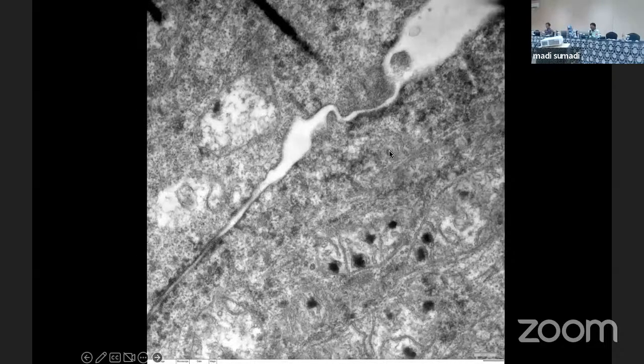And in the cells, you see one endothelial cell connecting to the other endothelial cells. Exactly, you see the connections, the cell-cell contacts. Then you have a kind of simulation of how the cells look in the tissue or body. That is exactly what you see here.